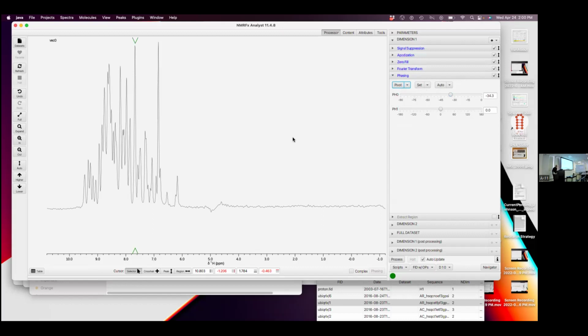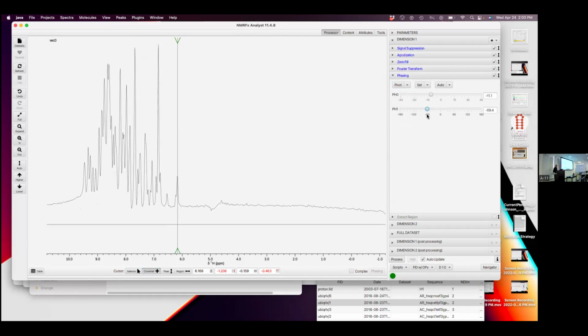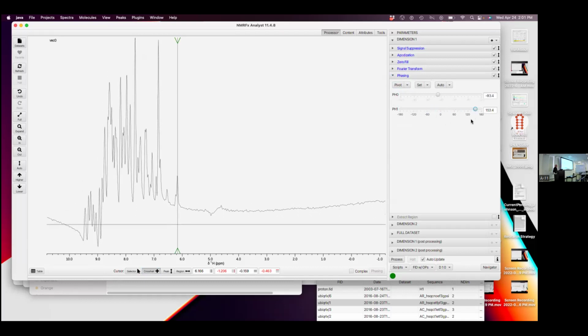So the alternative is to click on the crosshair button down here at the bottom. Now we have a crosshair, and we could set the crosshair on this peak, then go back, choose this menu, and say set the pivot at the crosshair. You see the little green triangle pointing out where the pivot is set. So now we can adjust that peak in phase. That's all this spectrum actually really needs. But if we needed, and this was out of phase, we could use the first order phase correction to adjust the phase in other places. And you'll see the phase at the pivot is not changed. Okay.